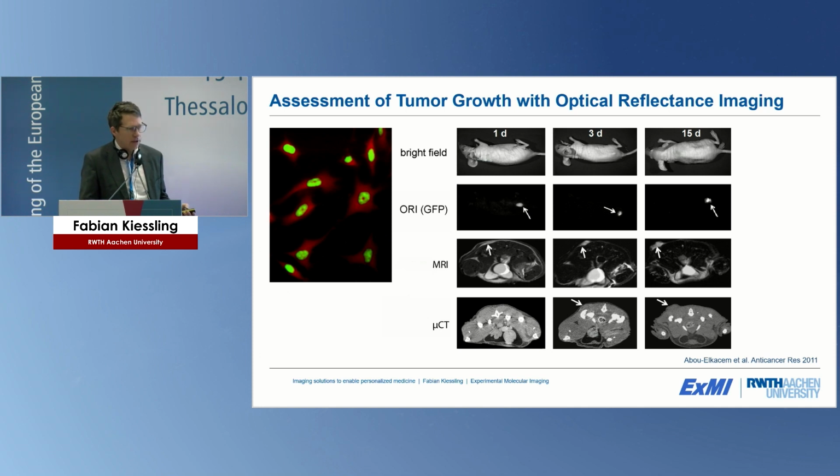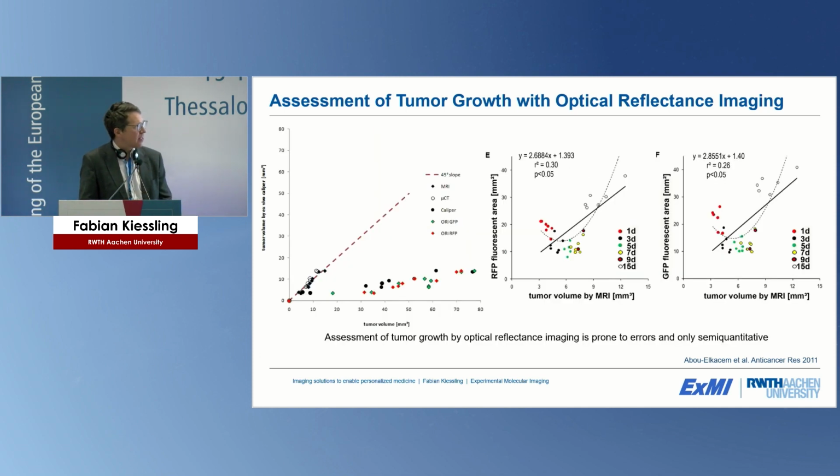But what about quantitative analysis? And there you see that we completely fail, that if you compare that to MRI or other imaging modalities, we underestimate the volumes and the growth of the tumors.